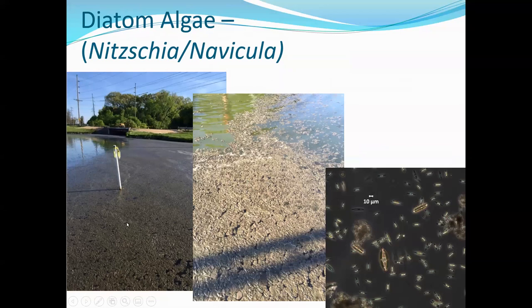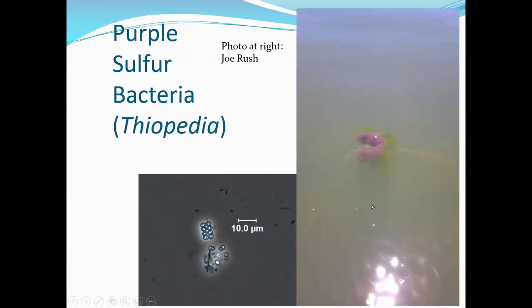This, again, it's 3D and puff paint. It is not what I thought it was. This is actually a diatom bloom. That is the culprit it's coming in from, and it's being washed downstream by some nasty weather. And these are all Nitzschia and Navicula and a few other diatoms, really, super, super dense. This is an unconcentrated sample. And they're also quite small, a lot of Nitzschia palea.